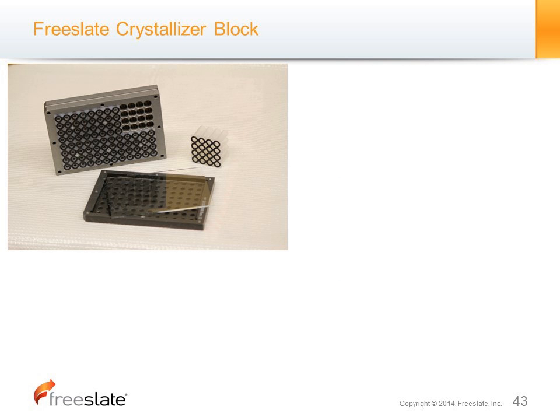And also this is the on-deck unit. The experiment is actually run within this thing called the Crystallizer block. If you take a look at the structure here, the build of this, you have a glass plate. You can use either a glass or quartz plate, where eventually the material will be deposited on this plate for the analytical at the end.